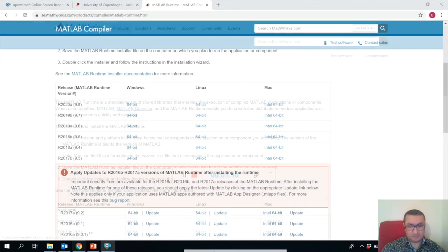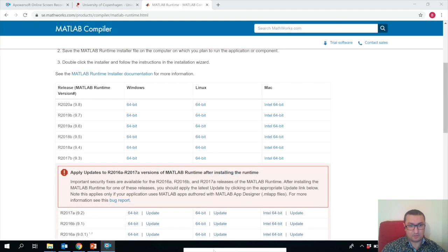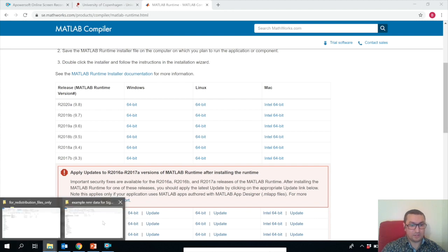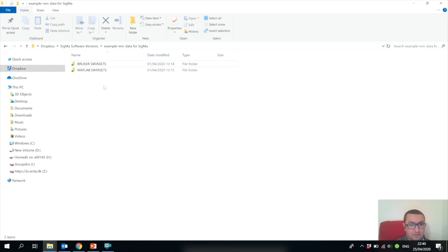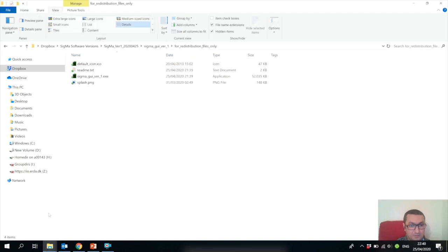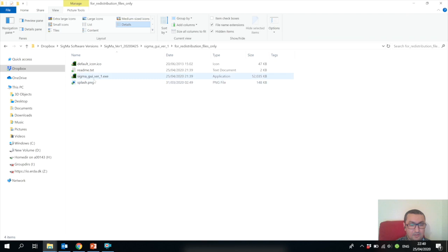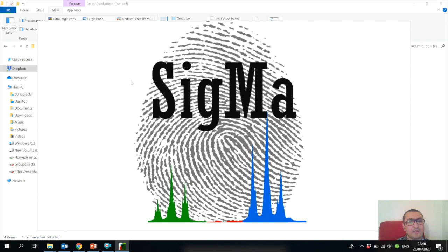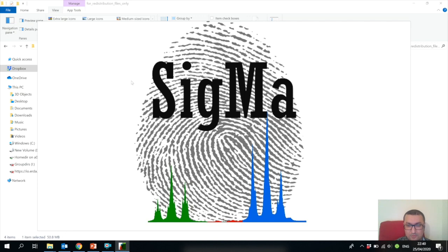This version of Sigma runs only on Windows, so you have to install the Windows version. Once you have installed it, you can go to the exe file and execute it by double-clicking. You will see the Sigma logo appearing. The first time you install and open it, it may take some time, so please be patient.